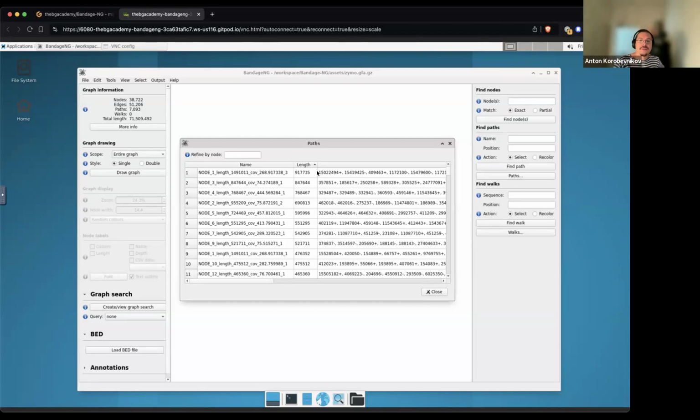This is the graph from the older version of SPAdes, so that emitted the assembly graph in the pre-GFA 1.2 format, and then we did not have a way to represent the scaffold paths. Actually, one of the motivations for the jump links added to the GFA 1.2 format was to represent the scaffold paths properly.